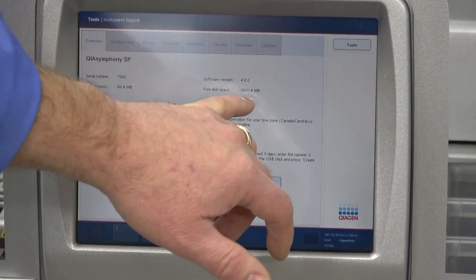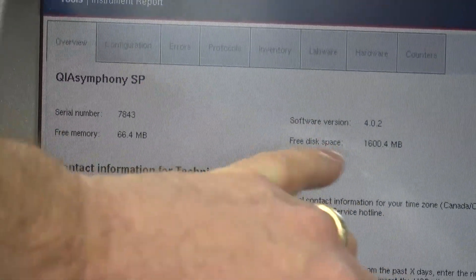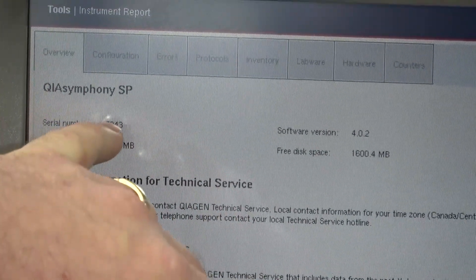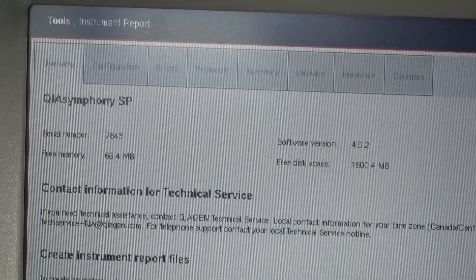Over here you can see it has the memory, free memory, and disk space, along with the serial number, and the software version is 4.0.2.